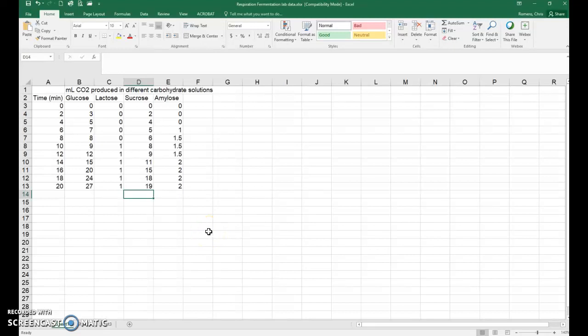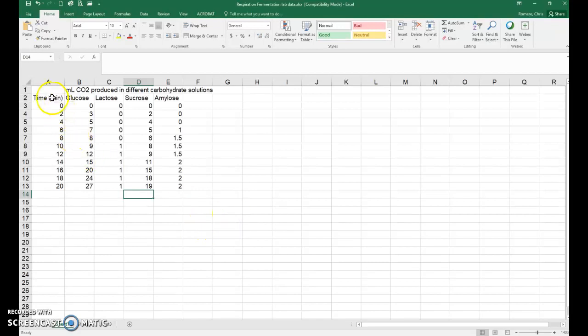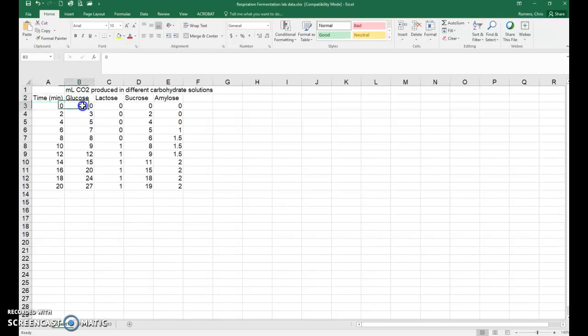As you can see I've entered my data into Microsoft Excel and I've got time in minutes in my A column. Notice I've labeled B, C, D, and E with the different types of carbohydrates that were used in the experiment and then I've got the milliliters of CO2 in the rest of the table.